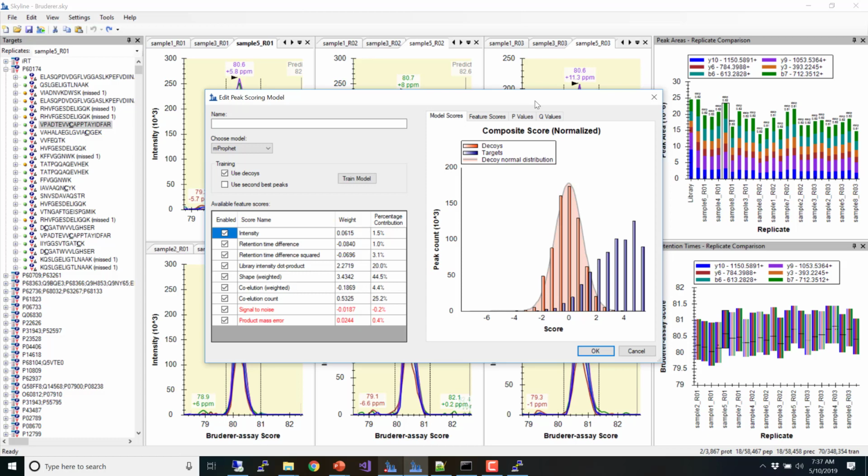So if you're using like a 30-minute retention time window or something, you can end up with retention times that are really far away looking really great. Because Skyline will end up giving this one a positive score and this one a negative score, and then all of a sudden a negative score squared ends up being positive anyway. So I would think more about, do you have a statistical reason to get rid of it, than about, oh, it's red, I'm going to get rid of it.